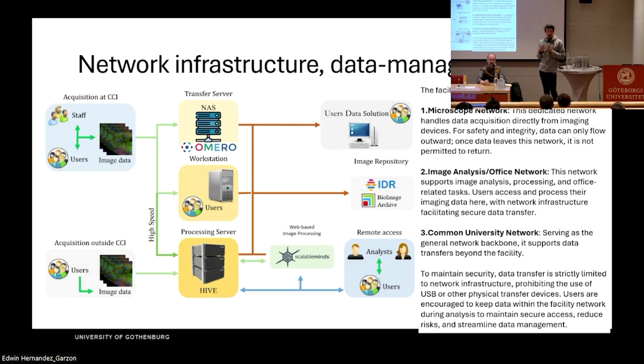Sometimes they say, okay, I want to do some processing, but I want to keep the data within your infrastructure. And I think we shouldn't forget that post-processing steps have to happen as close as possible to the microscope, because we have, for example, software that can handle this more easily than if they take it outside of the infrastructure. So they will send that data to workstations where they will do this, and after that, they can decide when to take it out.